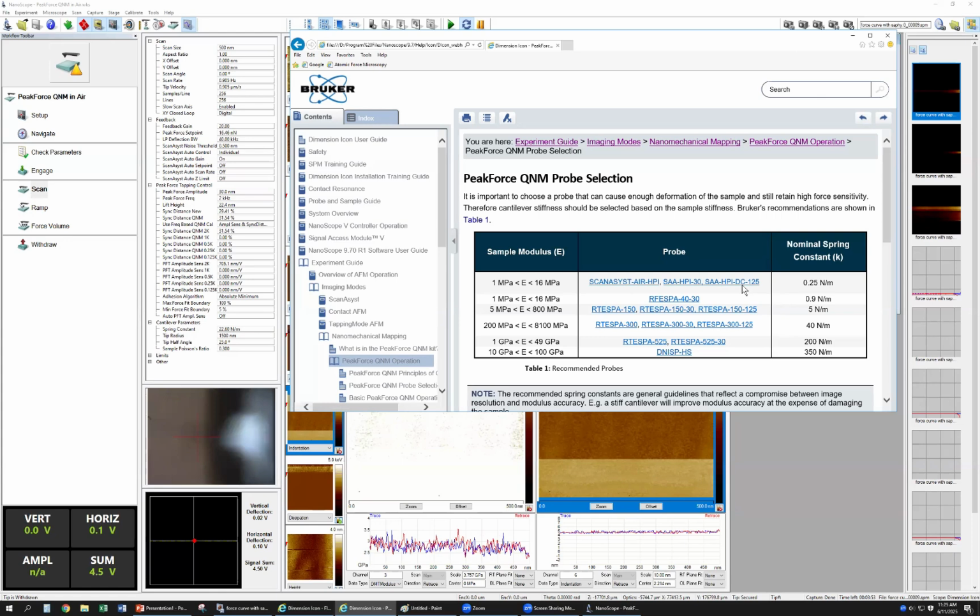How can you get the data for each one? For example, you get this code, right? Instead of having 5, you see this one is dash 30, right? That doesn't mean every one is 30. Each one is different. So you can get this code. How do you get the code for each one?